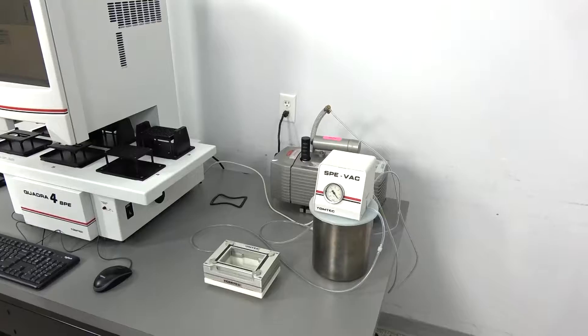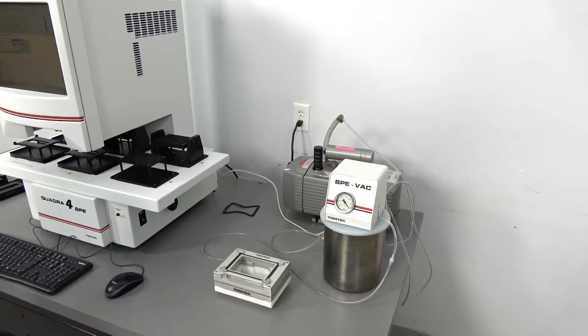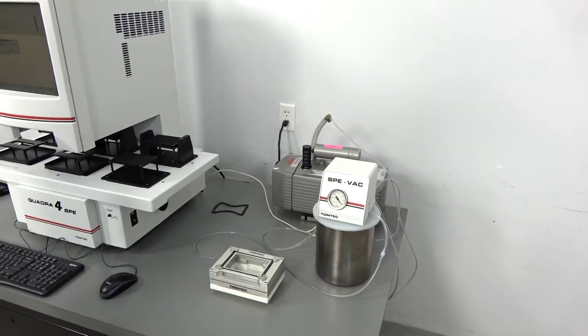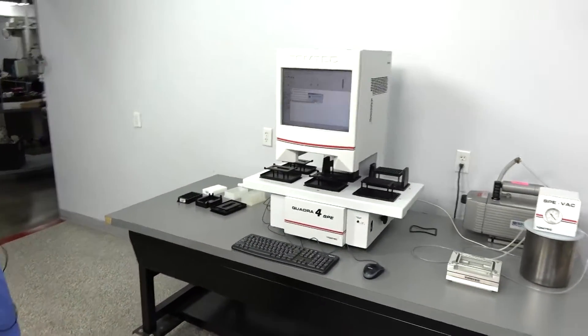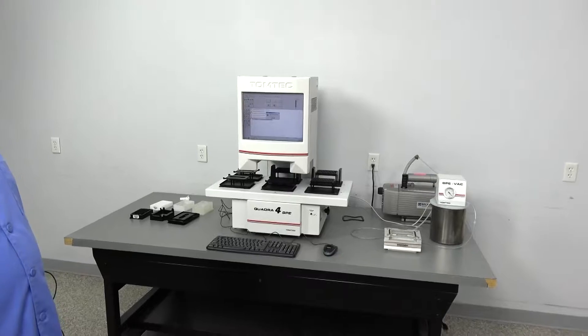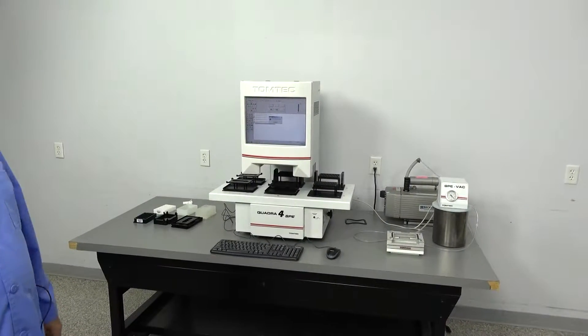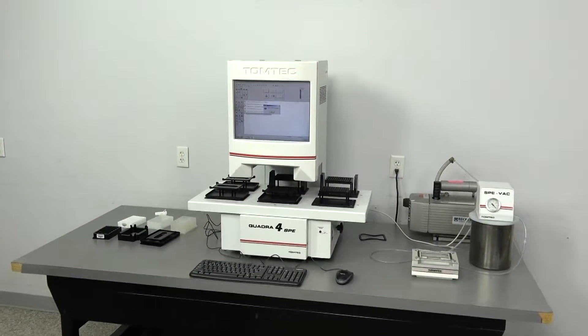It comes with an oversized compressor so that it will run basically forever. Anyway, there's our system. And again, it's available in our Cridersville, Ohio. That is PID 26502. Thank you.